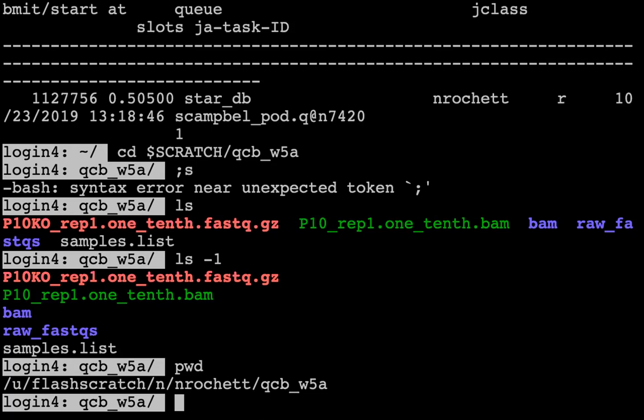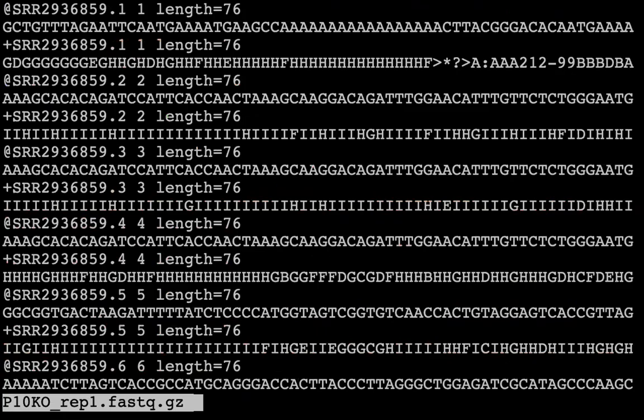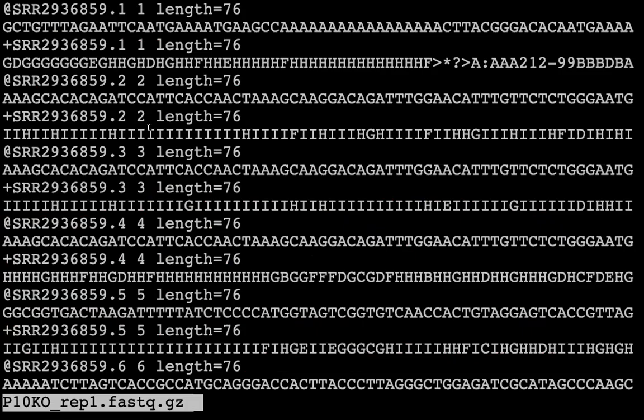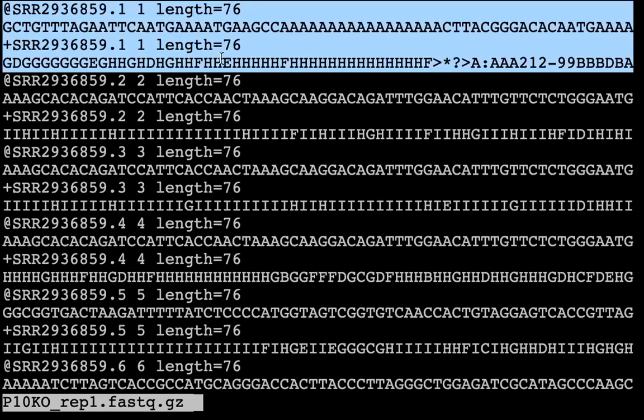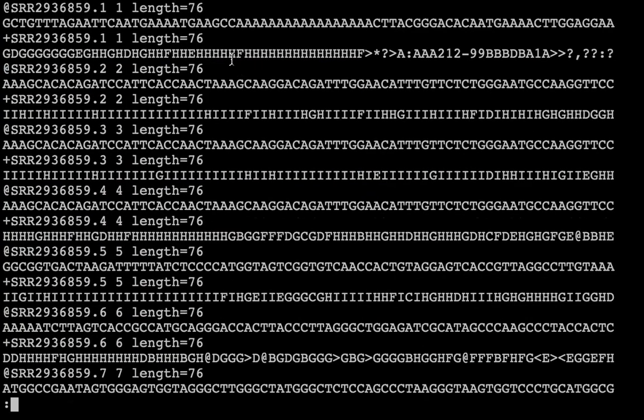Yes. And so the first thing I wanted to go back to before we actually start with FastQC is this question regarding FastQ files. If we take back the FastQ exercises, the question was: are the qualities of the second read good? So this is the file for the first sample here. I'm just viewing this, and the question was about the second read, just because it was less ambiguous. So this is a second read. If I make it a bit shorter, we can see the end of the read.